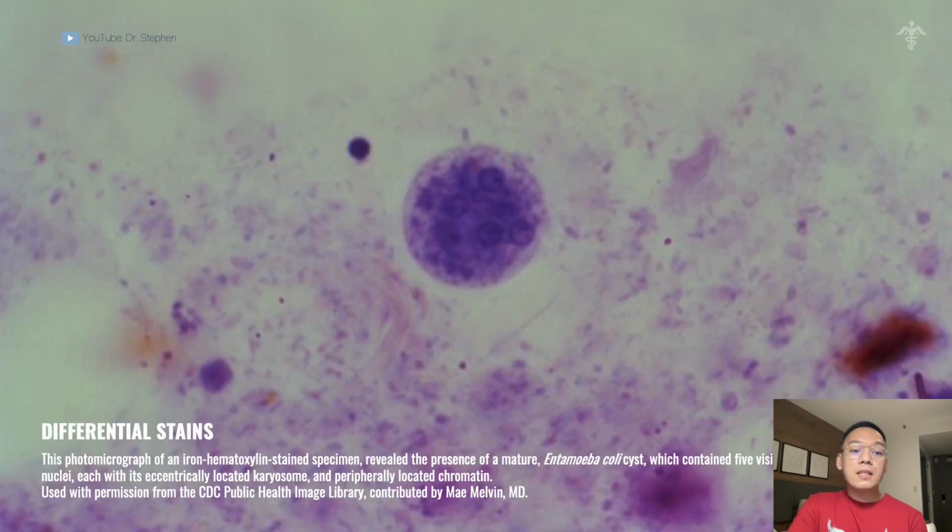With differential stains, this is also used. We call it the iron hematoxylin stain specimen. This reveals the presence of a mature Entamoeba cyst which contains 5 visible nuclei. These are the nuclei found in the middle, each with its eccentrically located karyosome and peripherally located chromatin.